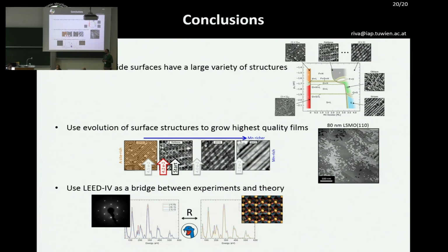And whether the number of spots, of beams that we have, is enough for then fitting our model to a structure. I think we are currently working on these improvements. I guess Lutz has recently tried with a simpler system, but a very large unit cell. I think it was a platinum 10 by 10 unit cell, and even then it looks like the code can handle these sorts of structures.